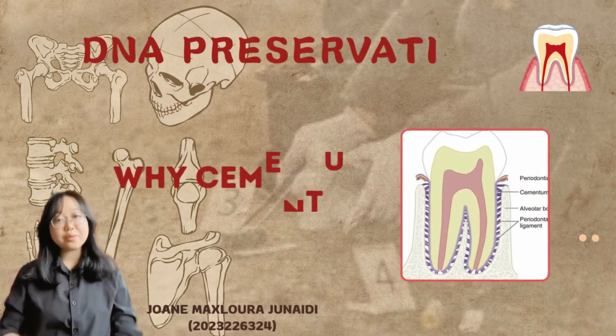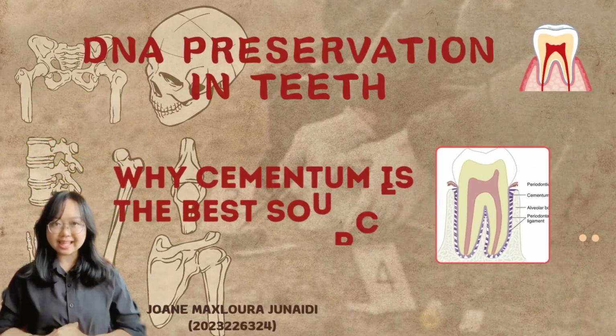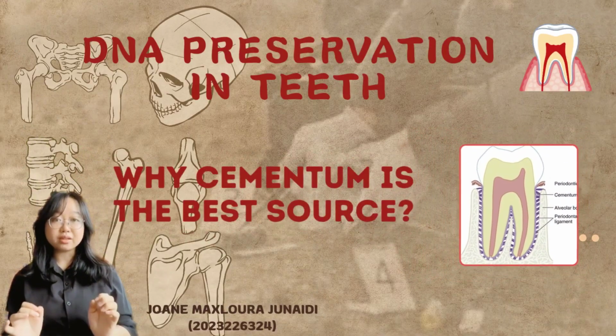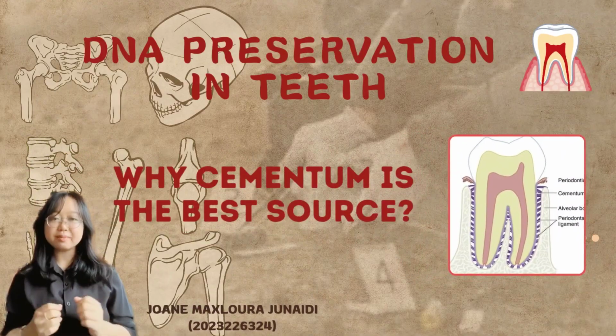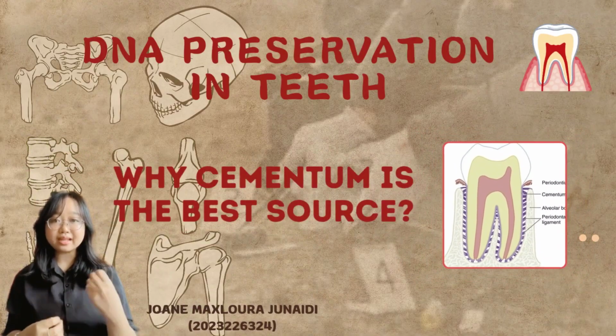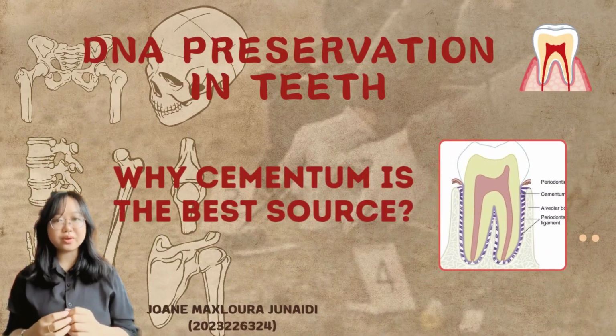Hello, I'm Joanne and I will be presenting about the DNA preservation in teeth and why cementum is the best source. Every tooth tells a story, but not every part of the tooth tells it equally well. In forensic biology, knowing where DNA hides inside the tooth and why it survived can be the difference between identifying the victim and never knowing who they were.